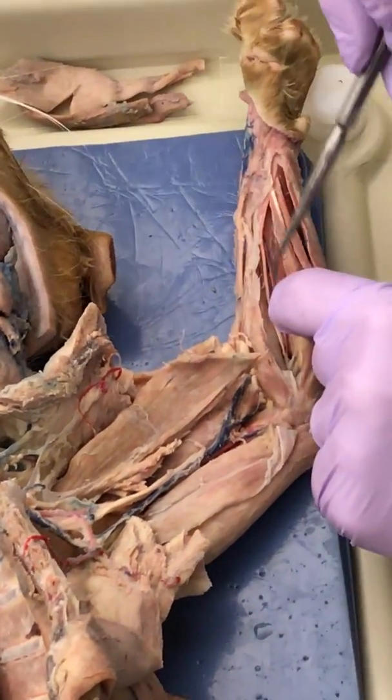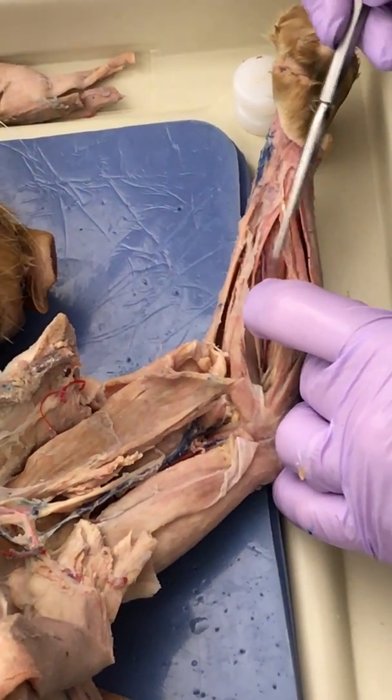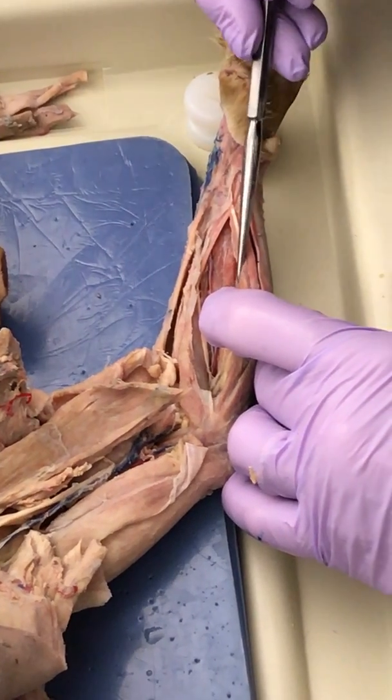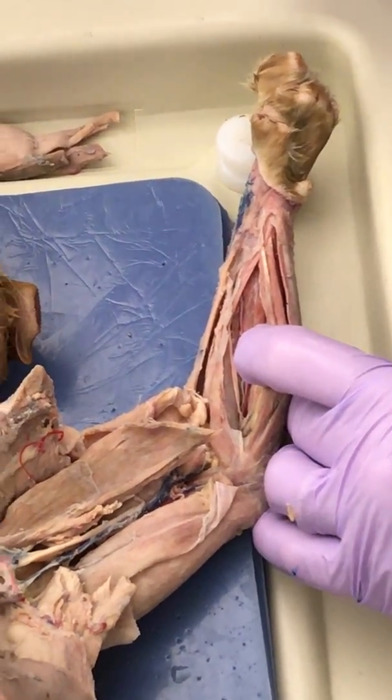Okay, then a minute ago I was just spending a little bit of time down here because your cat has really nice radial and ulnar arteries. Radial would be this one, of course, and ulnar would be this one branching off of it. It's okay?